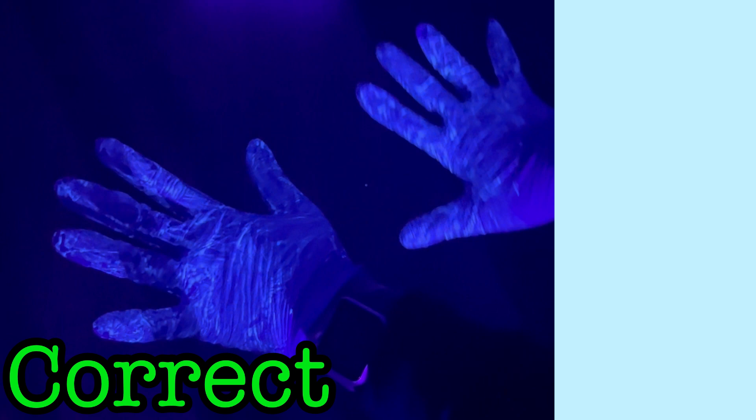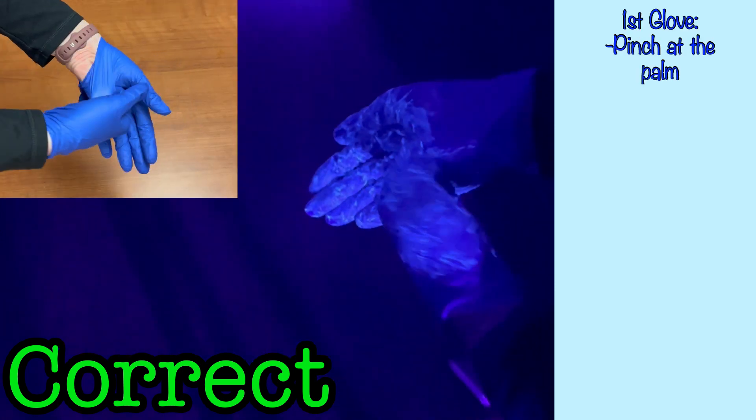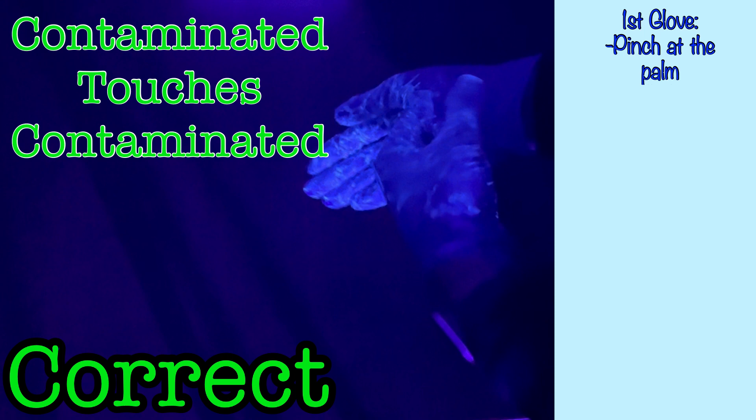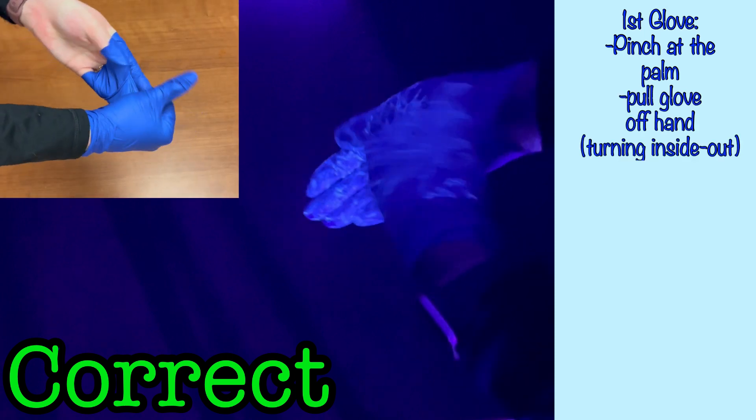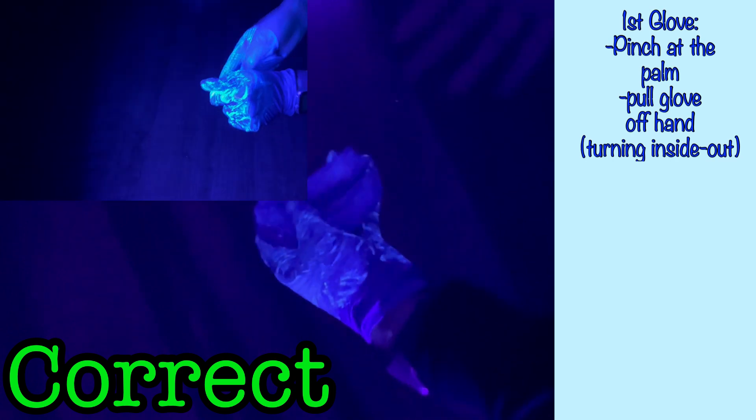The correct method for removing the first glove is to grasp by pinching the glove at the palm, so your gloved hand will not come into contact with any skin or clothing. The contaminated surface of one hand will only contact the already contaminated surface of the other hand. Then gently pull the glove off the hand, turning the glove inside out in the process. This will minimize the flinging of contaminant we saw with the incorrect method.